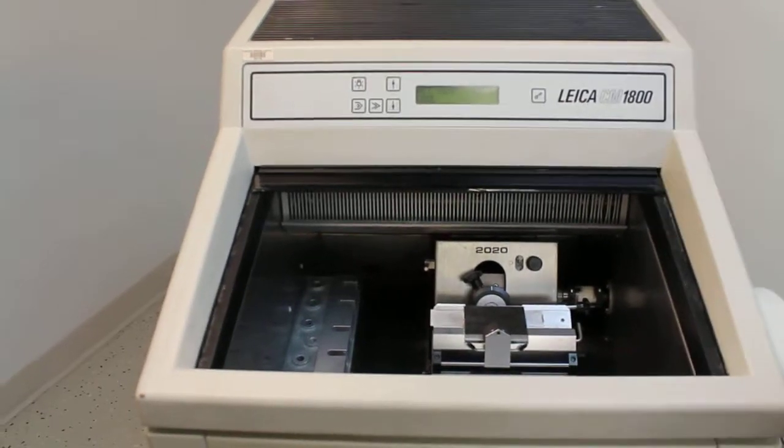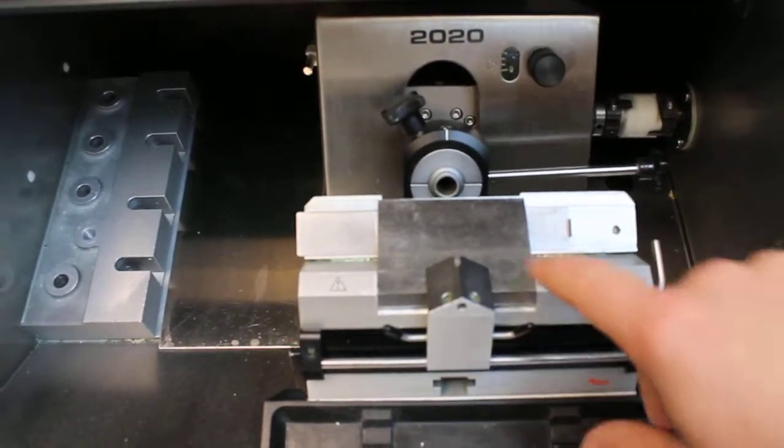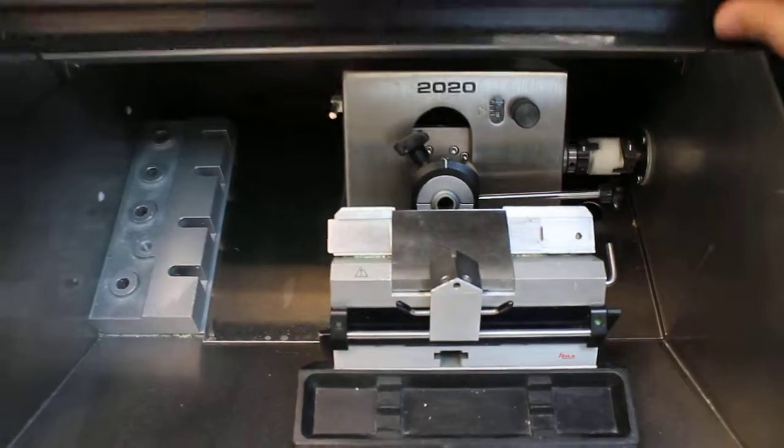I can show you a close-up here of the knife holder assembly. You can see the disposable blade holder right there.